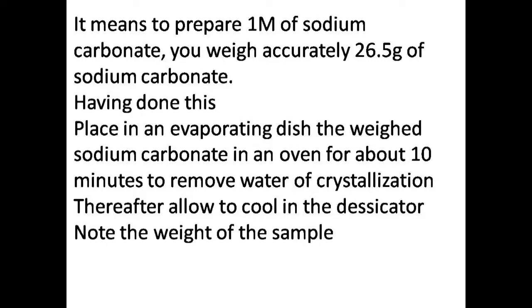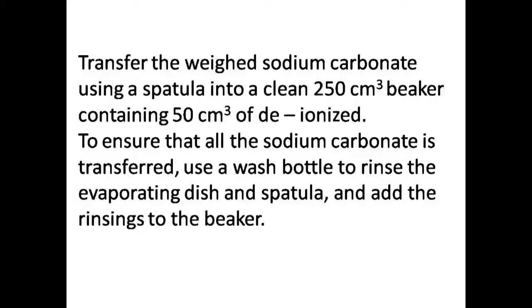So the 26.5 grams of sodium carbonate we have weighed, we place in an evaporating dish and put it in an oven to dry for 10 minutes. You remove it and allow it to cool in a desiccator. After that, you note the weight. Having noted the weight, you transfer the weighed sodium carbonate using a spatula into a clean 250 cm³ beaker containing 50 cm³ of deionized water.